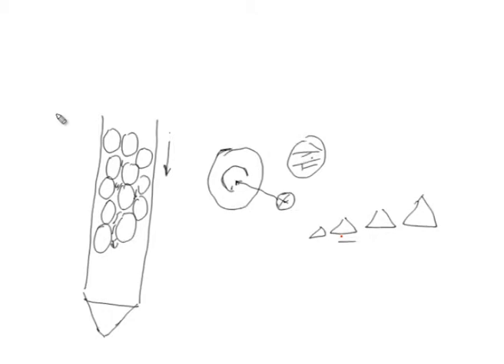So, that is how the separation occurs, because they are moving down, as you have a continuous flow system, and they are moving down at different speeds, or at different rates actually, which are eluted at different rates. So, this is a very simple basic principle of column chromatography, of gel filtration chromatography.